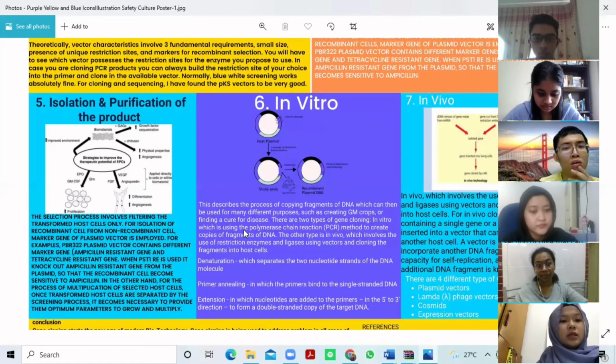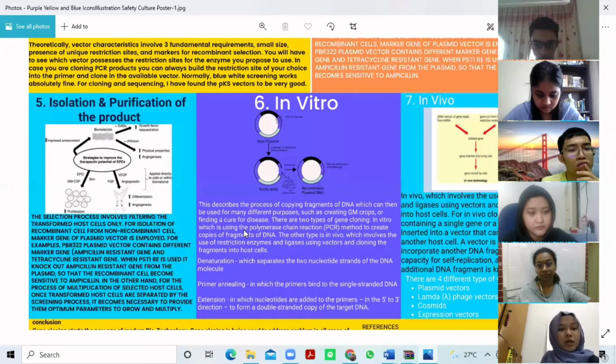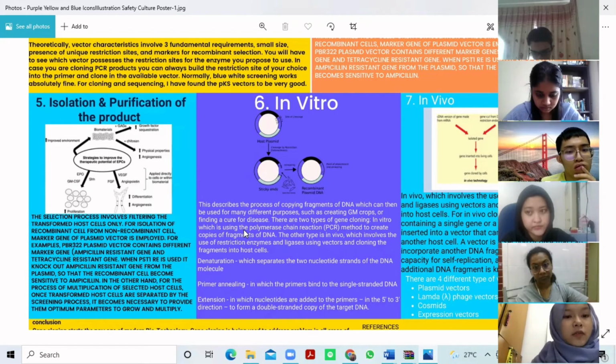Therefore, experimentalists are easily able to identify and conduct further studies on multiplied clones while ignoring those that do not contain recombinant DNA. This is followed by purification of the isolated gene copy or protein. Purification is the chemical and physical separation of chemical substances of interest from foreign or contaminating substances. The pure result of a successful purification process is termed an isolate.